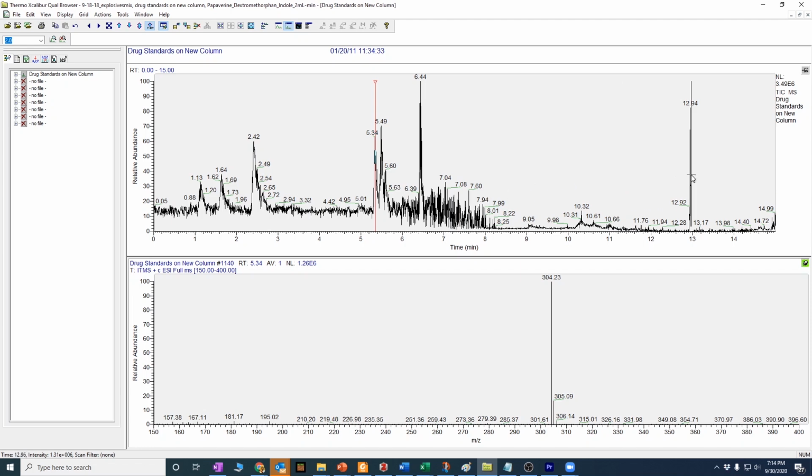Why would I keep the HPLC going? Hopefully you said, you know what? He's probably cleaning and re-equilibrating, as we talked about before when we talked about pumps. Yep, I cranked this up to clean off anything that might be left in there, and you can see some stuff came out, and then I re-equilibrated for a few minutes.